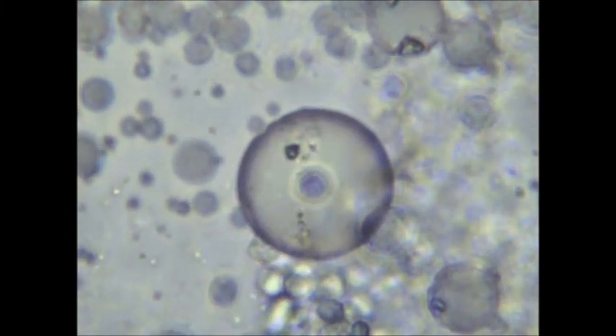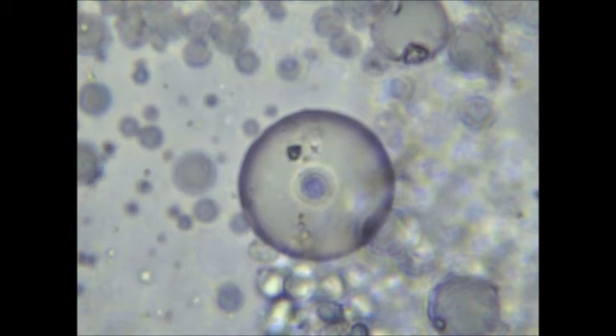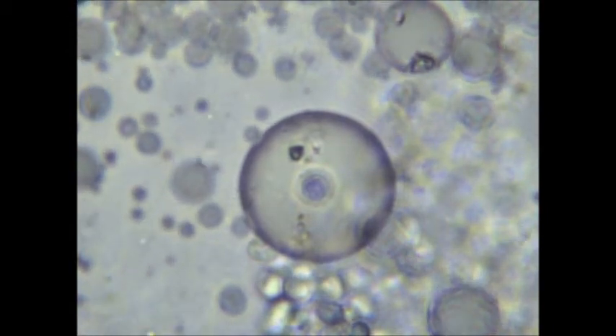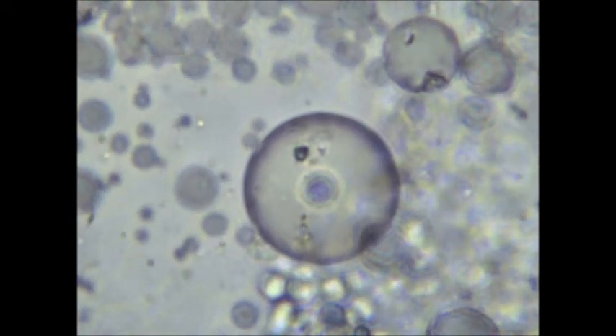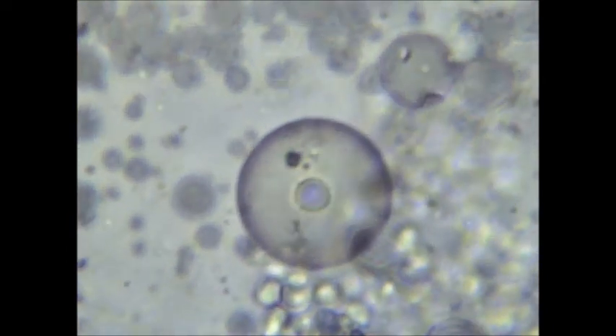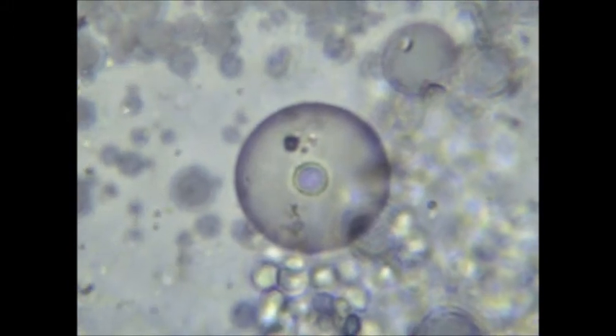Hello again YouTube. I'm back with yet another video. I found something really interesting and I had to make a video about it. What you are looking at is a fatty acid vesicle with what appears to be another smaller vesicle inside of it.